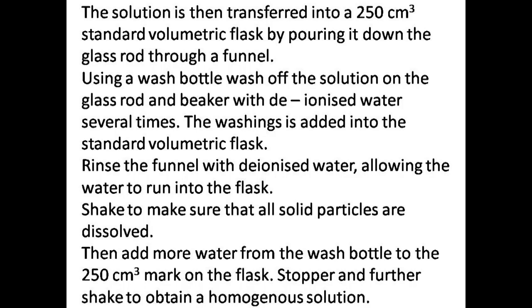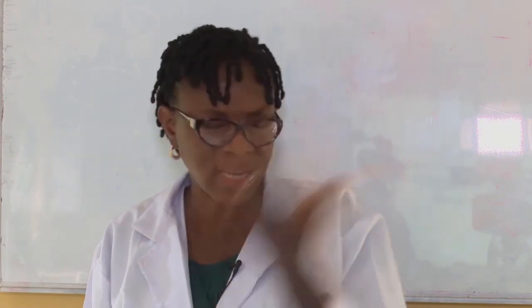Then add more water from the wash bottle to the 250 cm³ mark on the flask, stopper, and shake further to obtain a homogeneous solution. In that way, you have prepared your standard solution of 1 molar sodium carbonate.